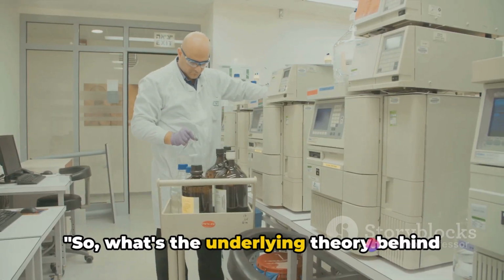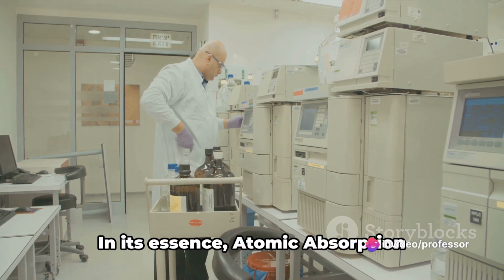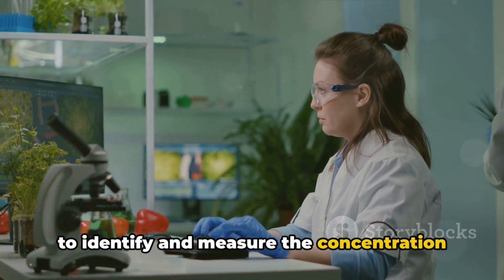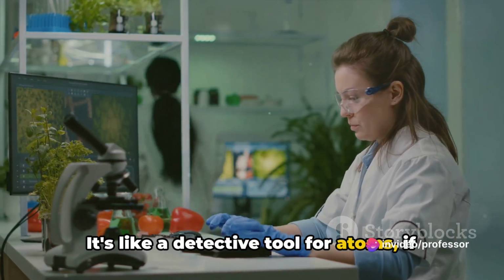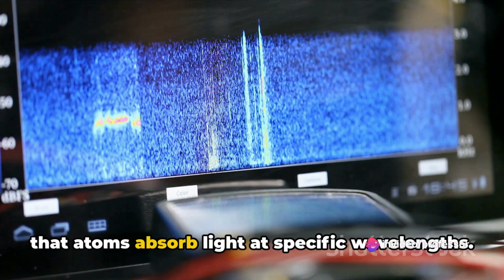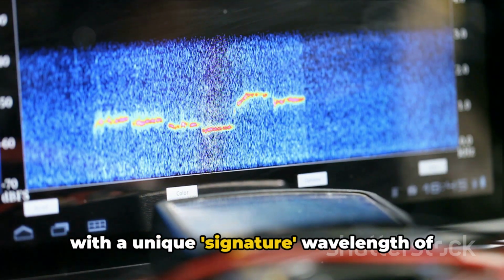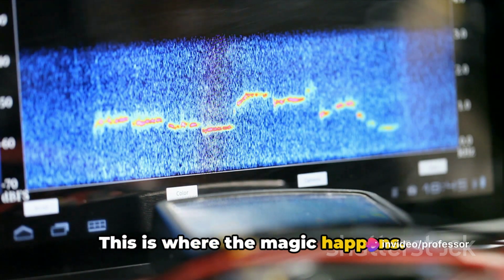So what's the underlying theory behind atomic absorption spectroscopy? Glad you asked. In its essence, atomic absorption spectroscopy, or AAS, is a technique used to identify and measure the concentration of specific elements within a sample. It's like a detective tool for atoms, if you will. At the heart of AAS lies the principle that atoms absorb light at specific wavelengths. Picture a sea of free metallic ions, each with a unique signature wavelength of light they prefer to absorb. This is where the magic happens.